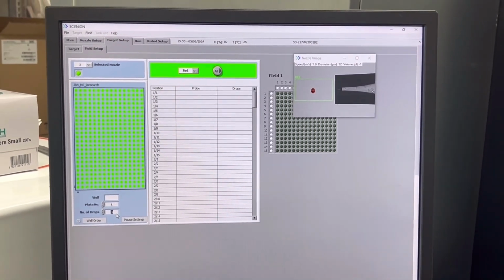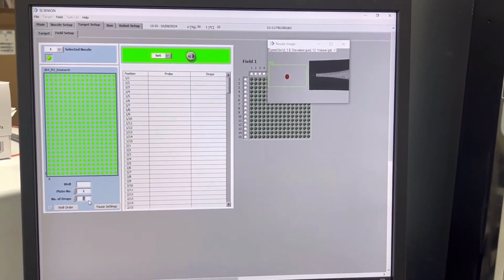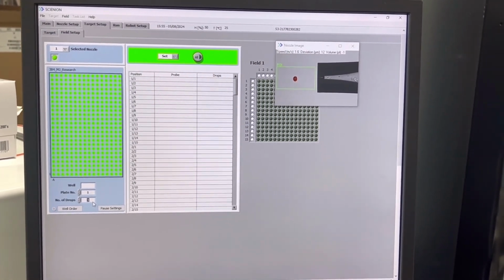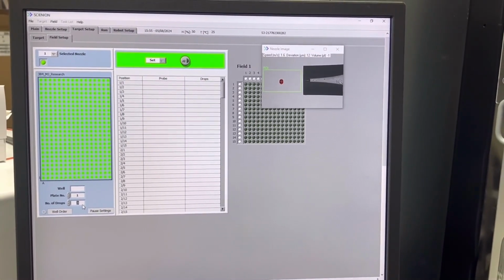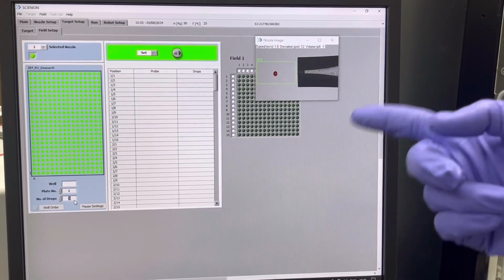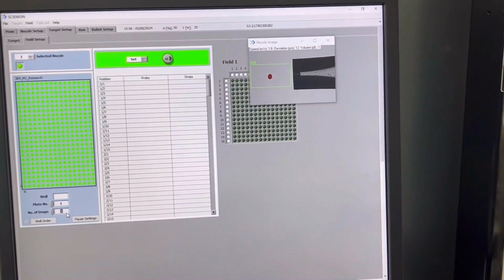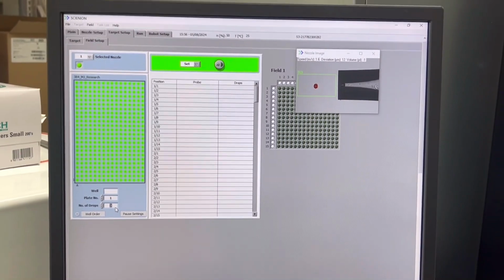Right? Yeah. And one drop is usually 180 picoliter for one drop. Yeah. So if we want to increase the volume to see the drop more clear, we can increase the number of drops, or we can increase the concentration.